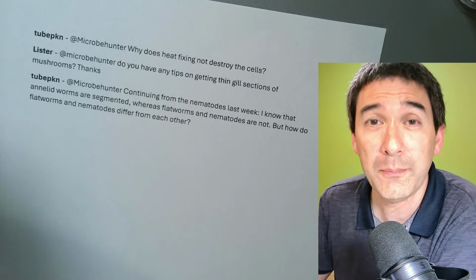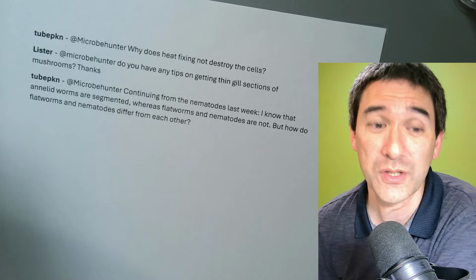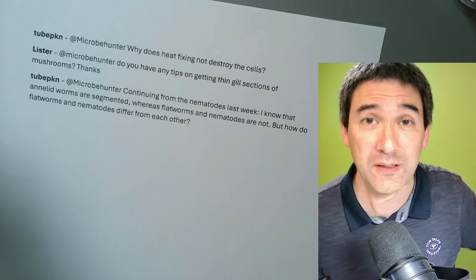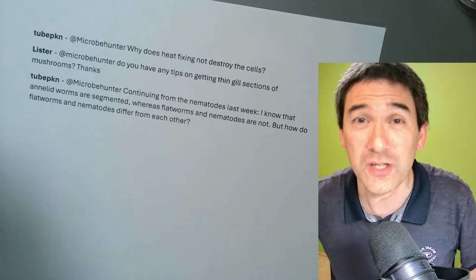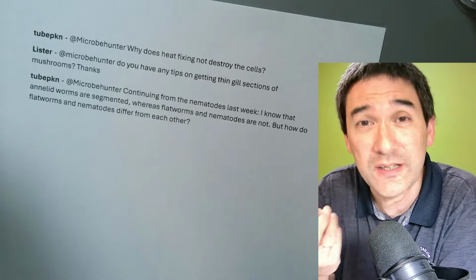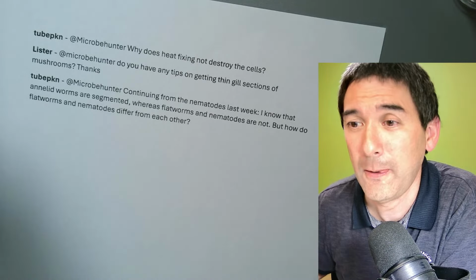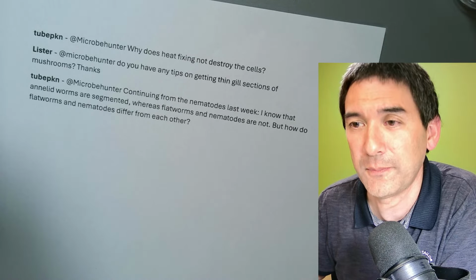Right now, I'm not doing those experiments. I'm not even working sterile, as I've got my glass jars with water samples in there. And I'm happy if they're not pure cultures, if I've got a lot of interesting things growing in there. So my objective is entirely different from the objective you have at a university, where you need to do systematic, reproducible experiments.